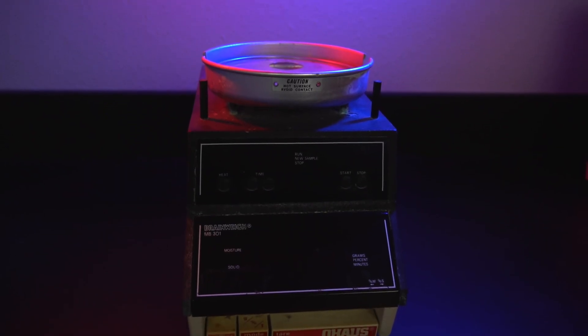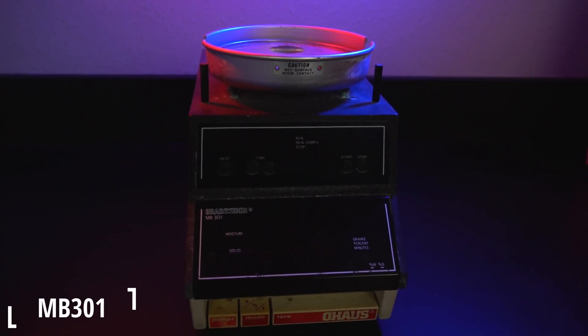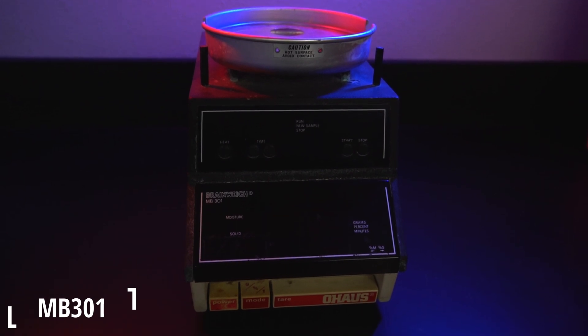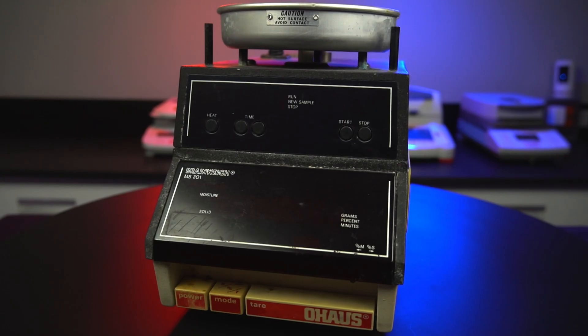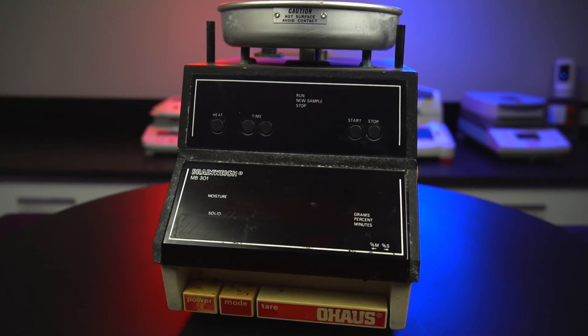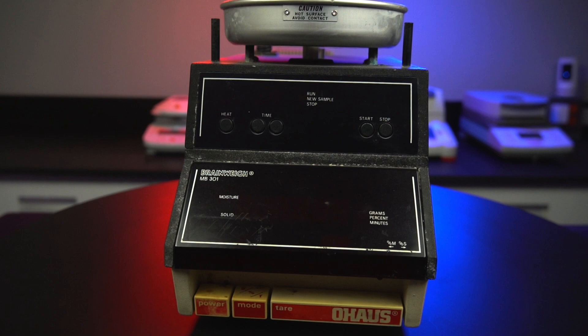The very first model we have here is the MB-301. Originally released in the mid-80s, the 301 was designed to be versatile, accurate, and easy to operate. This unit uses a lamp as a heating source, which we are unfortunately missing — it is a very old unit after all.